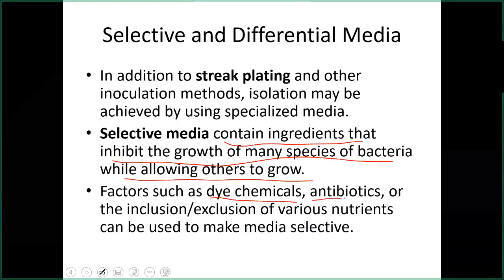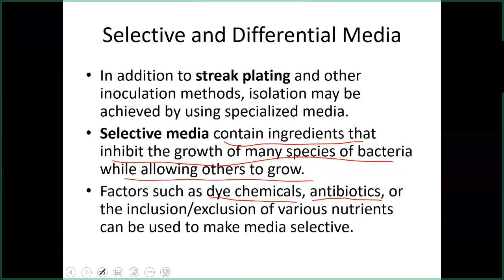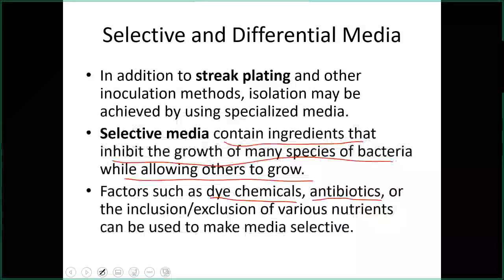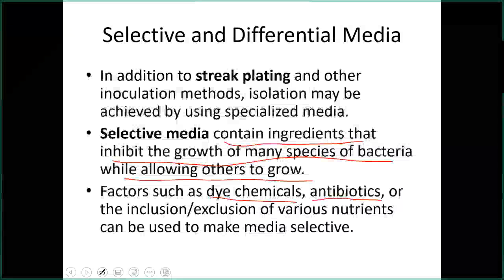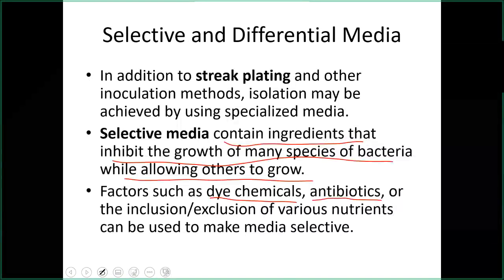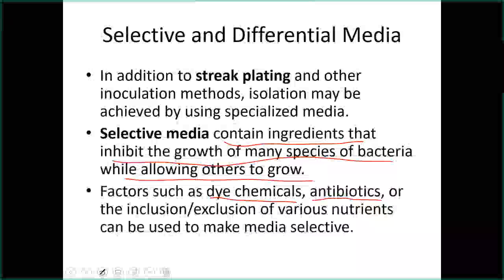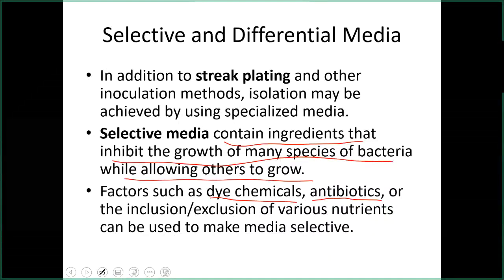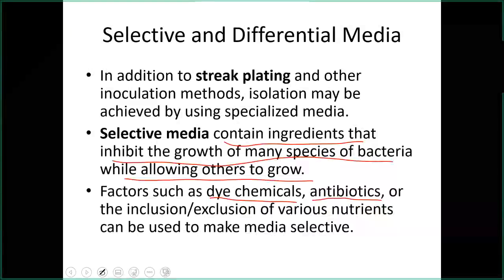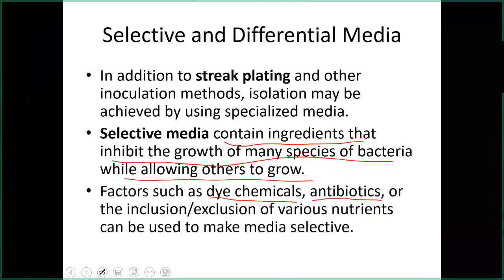Of course, there are antibiotics, which again, don't kill viruses. Somebody's been saying that in the media recently. Antibiotics kill bacteria. They don't work on viruses. I'm sorry, azithromycin is not going to kill viruses. But you can include an antibiotic, and it turns out that some antibiotics are especially effective against, say, gram positives. So if you include an antibiotic that is especially potent at killing gram positives, you will select gram negatives, and those are the ones that'll grow.